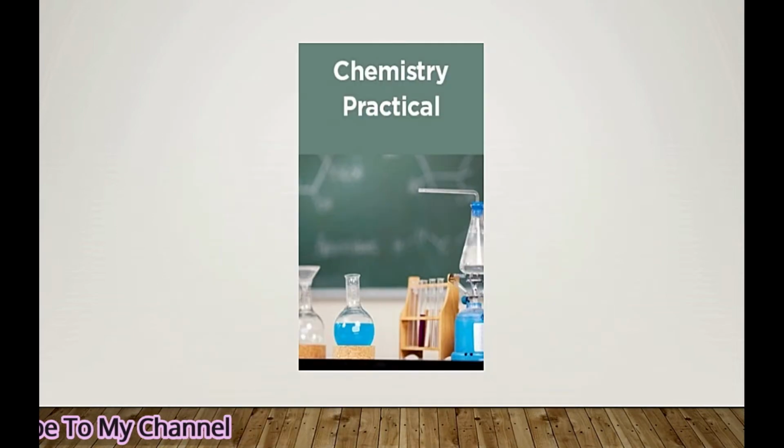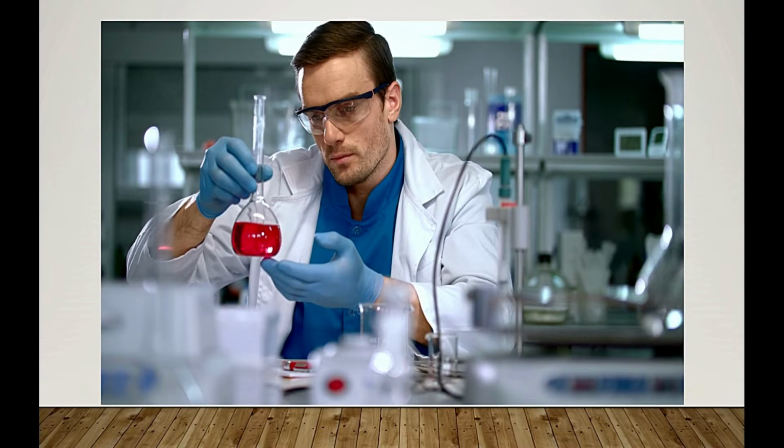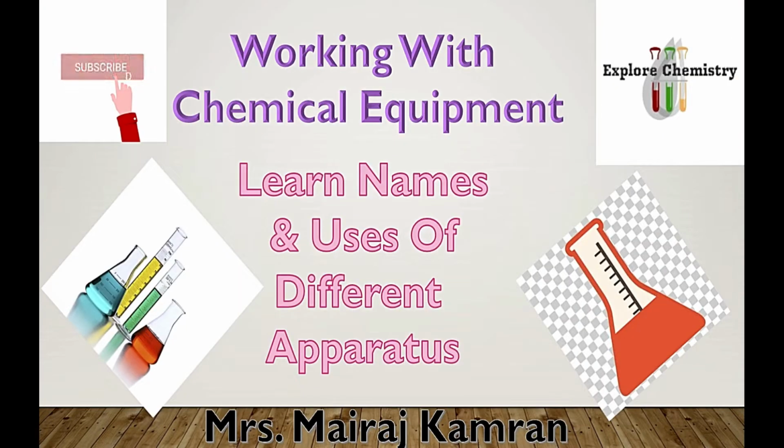So whenever you perform a chemistry practical, you will work with different chemical equipment. You should know the use of these equipments as well as their names. So in this video, you are going to learn the use of these chemical apparatus and their names.